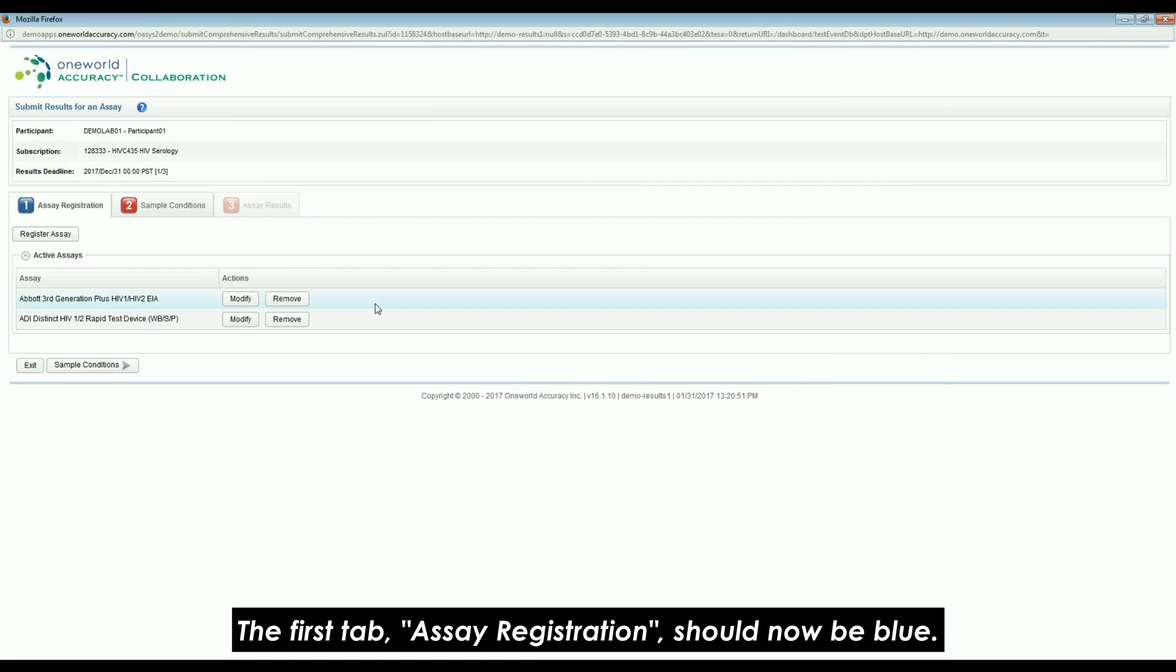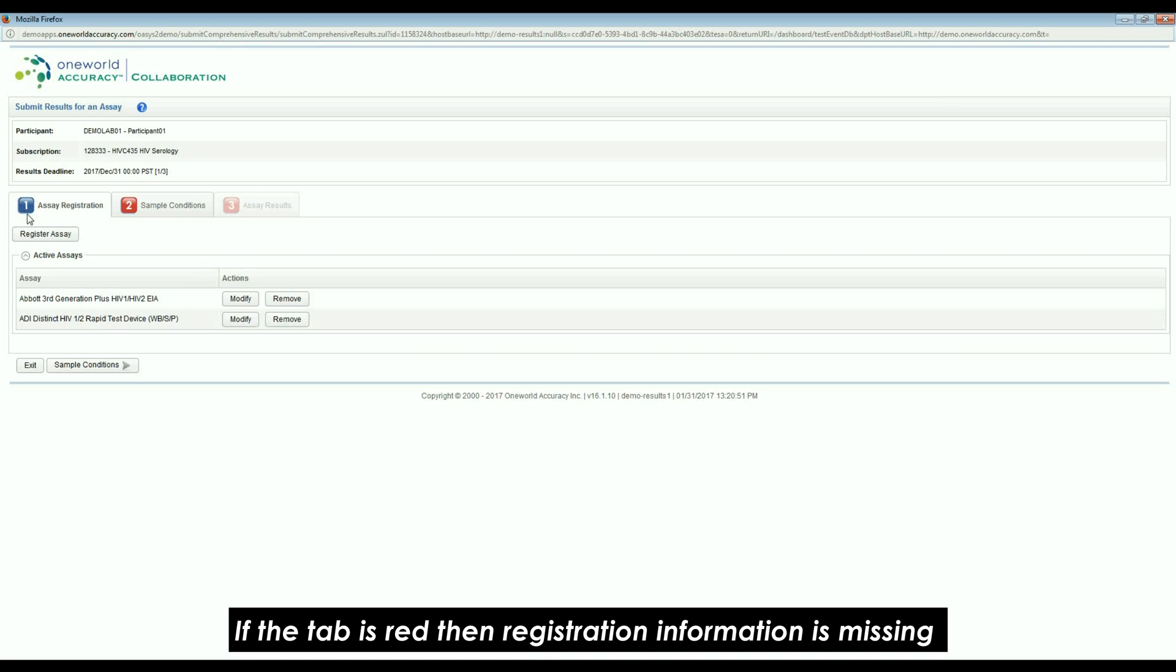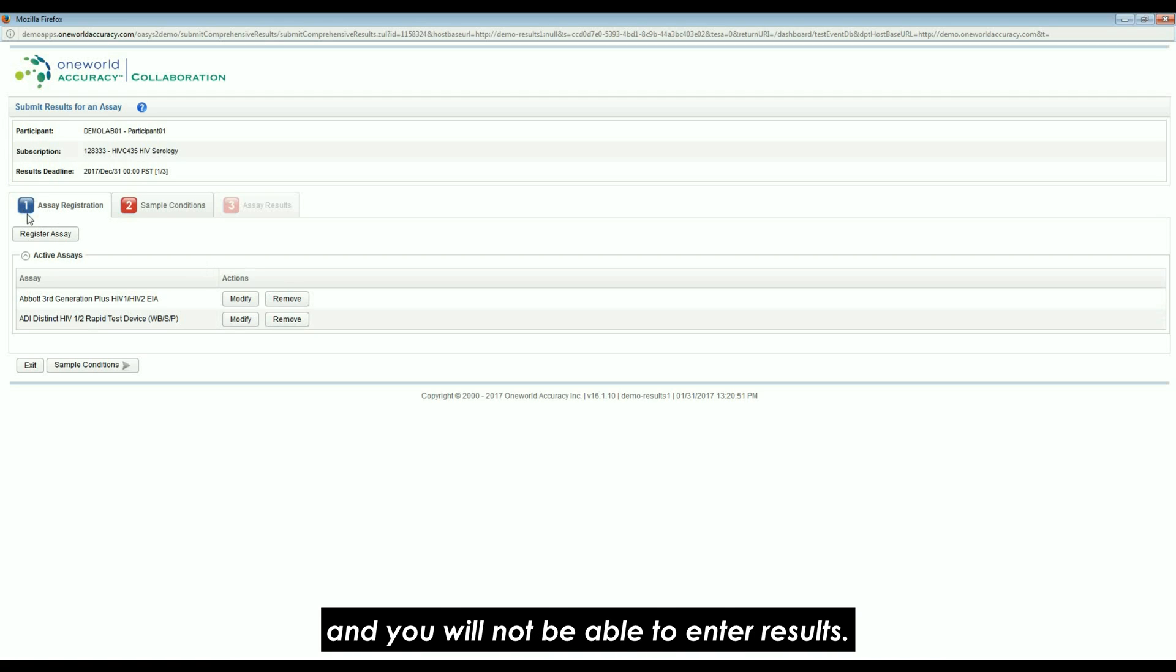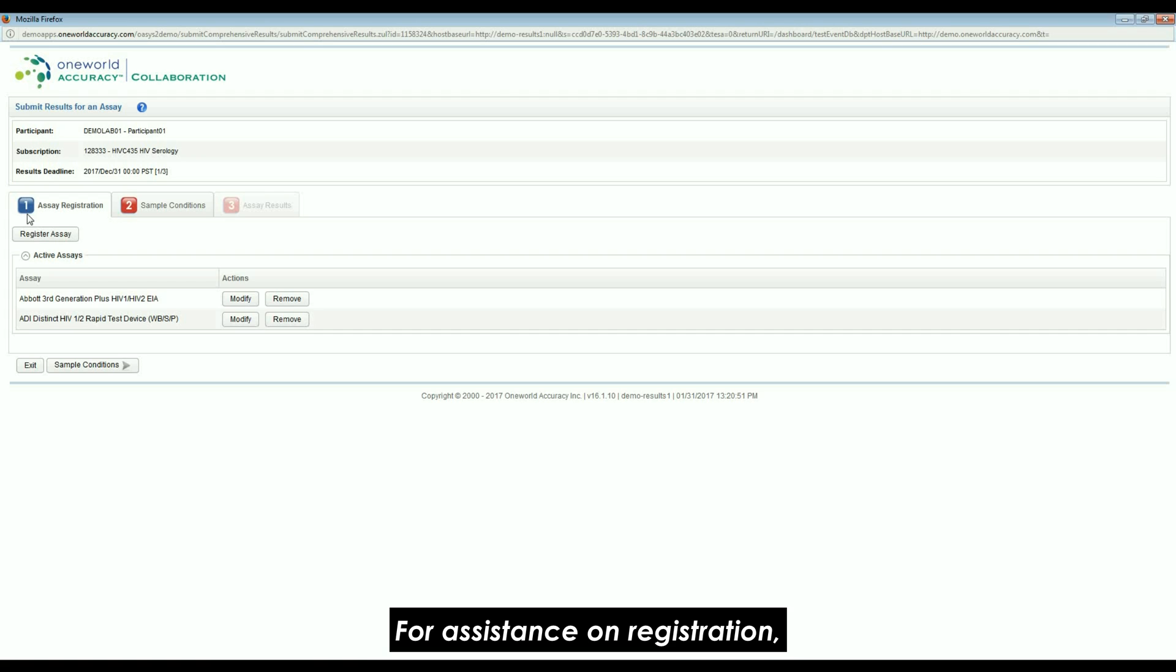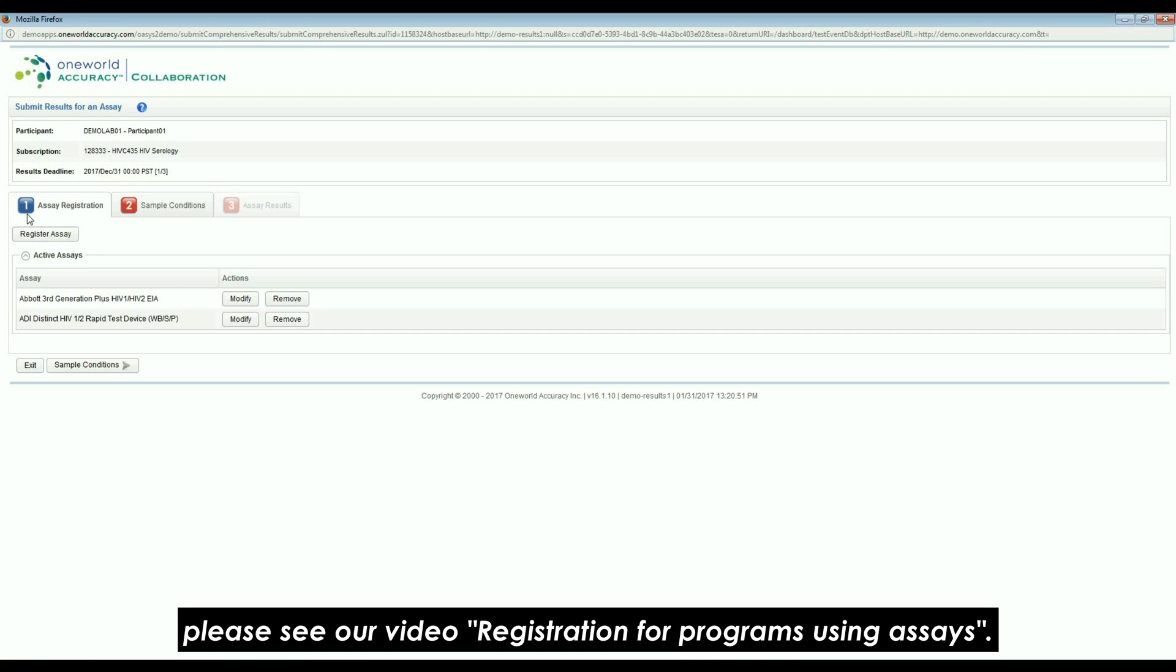The first tab, Assay Registration, should now be blue. If the tab is red, then registration information is missing and you will not be able to enter results. Please complete the registration. For assistance on registration, please see our video registration for programs using assays.